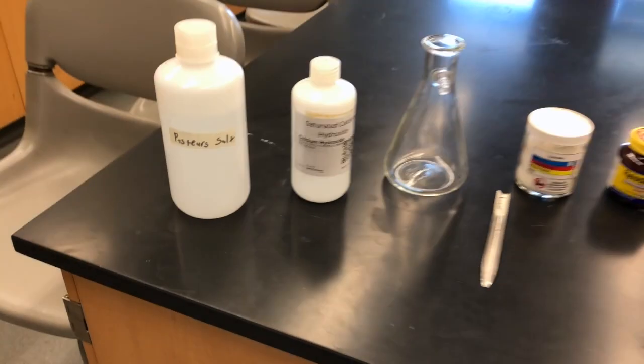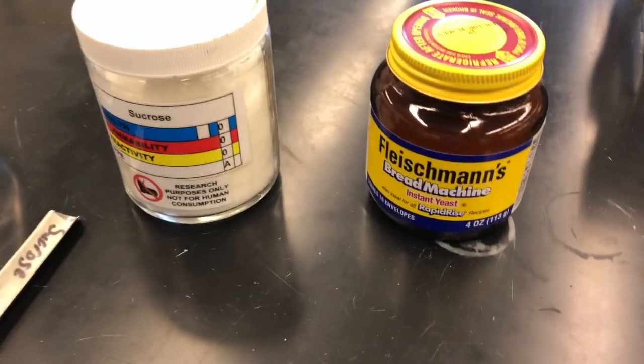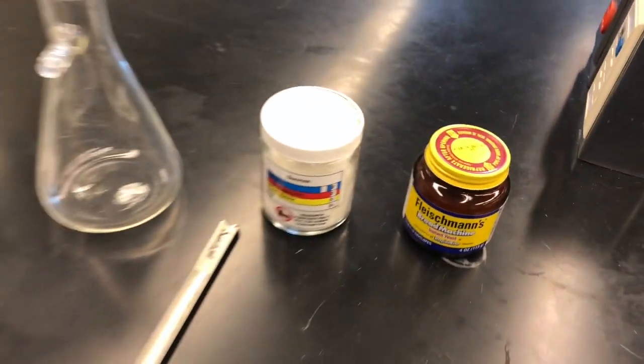We'll start with setting up our fermentation, getting all of our materials together. We start from the left, we have our Pasteur's salts, solution of calcium hydroxide, our flask, our sucrose, and our yeast.